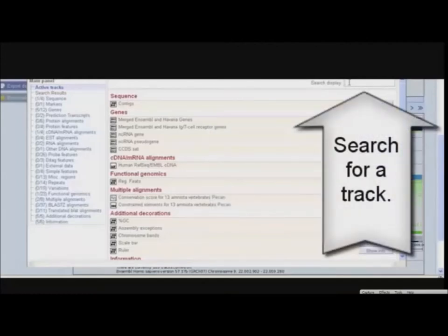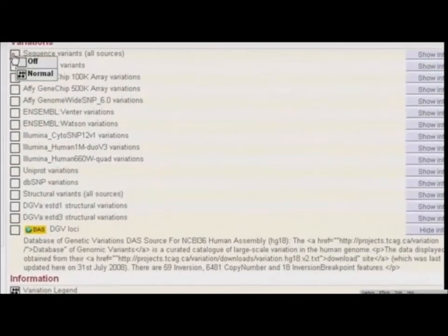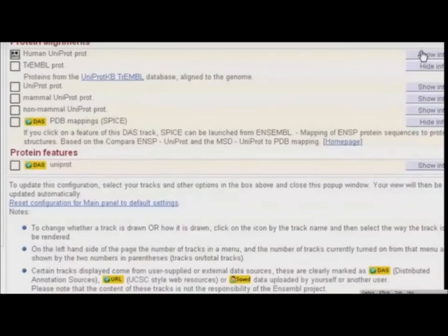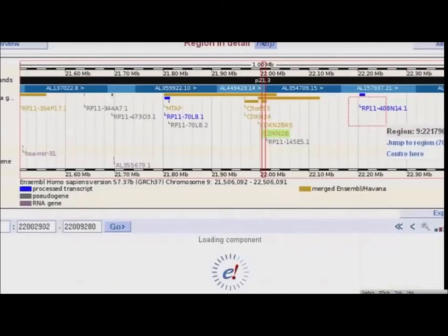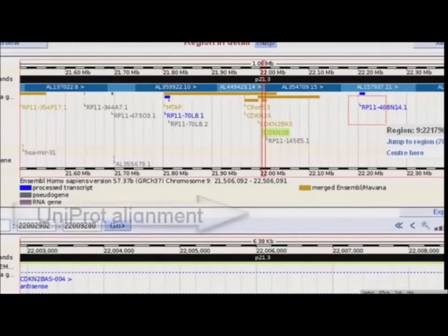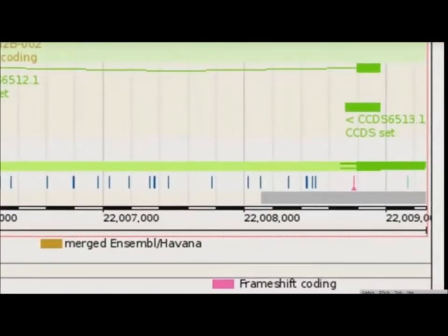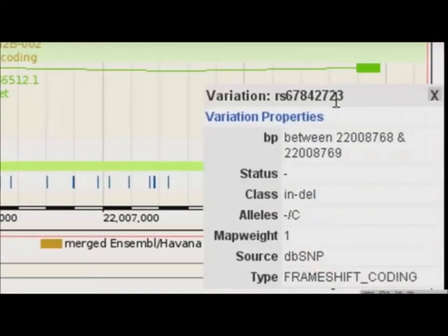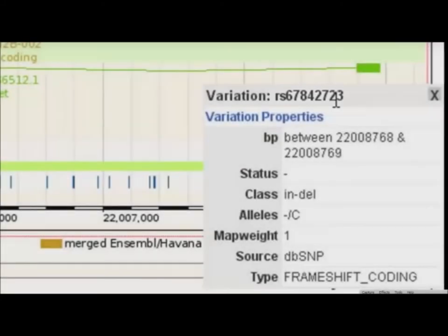Let's choose to see variations. I'll search for it here, or browse the menus for tracks. Select Sequence Variance All Sources. Let's also add Uniprot alignments. Click Show Information to learn more about this source. Save and close the menu. The page should reload. You might see that a protein from Uniprot aligns to the region of the genome. Variations are shown as vertical lines along the genome. Triangles indicate insertion-deletion mutations. Click on the pink Frame Shift Coding variation. A variation box should appear. This insertion-deletion mutation has an RSID from NCBI-DB-SNP.